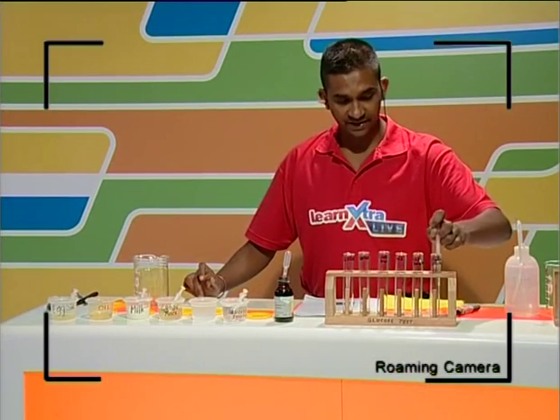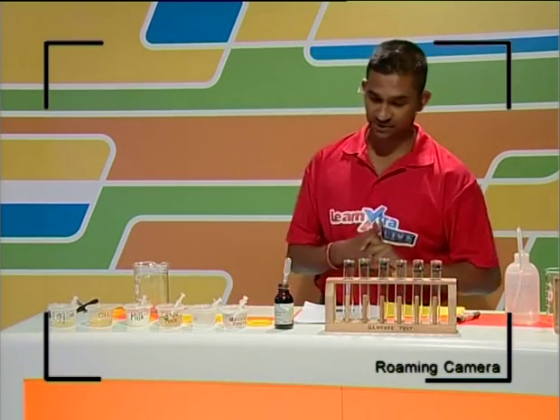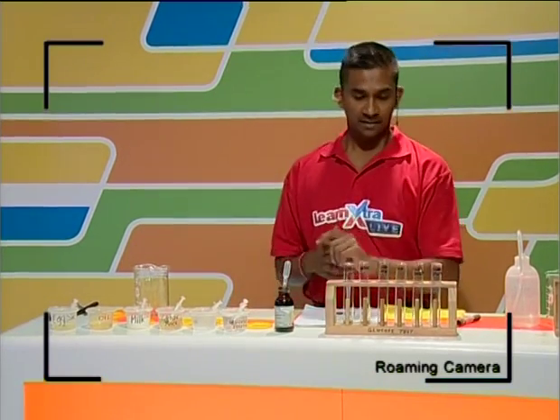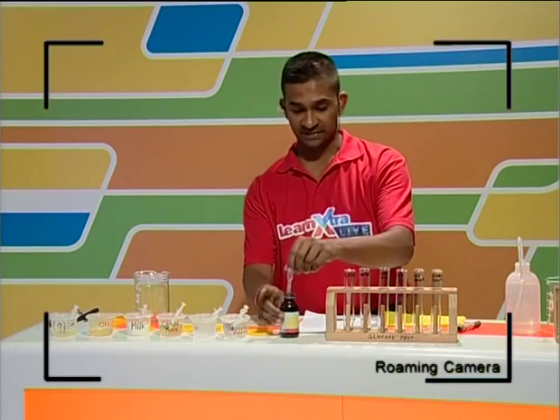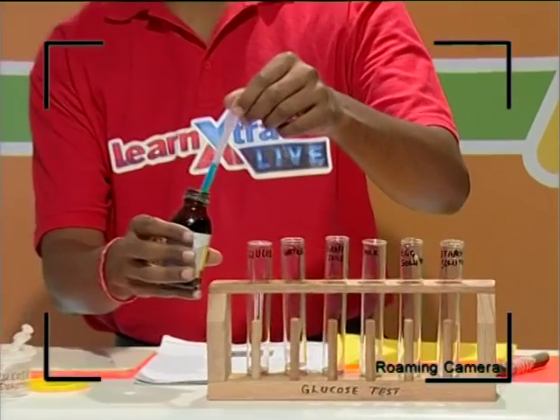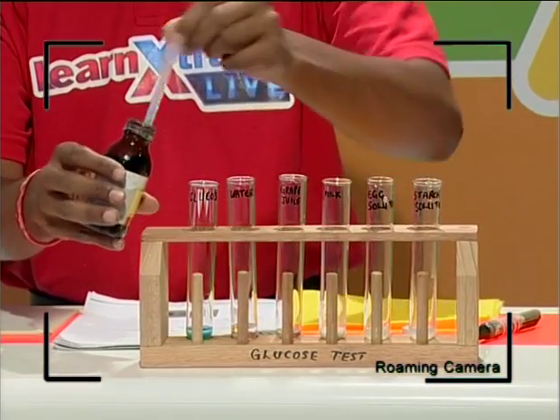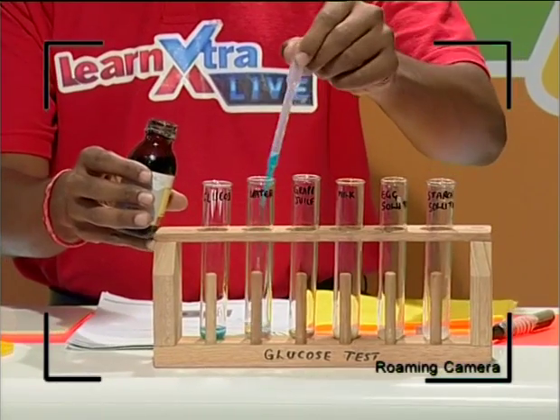So we've created now a series of 6 test tubes, and the important thing is to make sure that you've got your test tubes labeled. We're then going to add in an amount of Benedict's reagent. We're going to try and add in about 2 mLs of Benedict's reagent into each one of these. Okay, that's Benedict's reagent into the first one, into the second one.